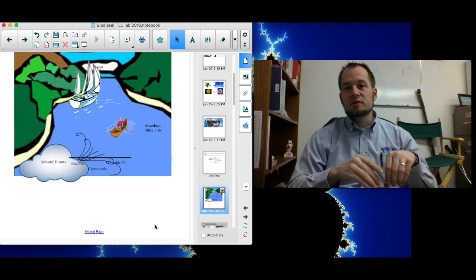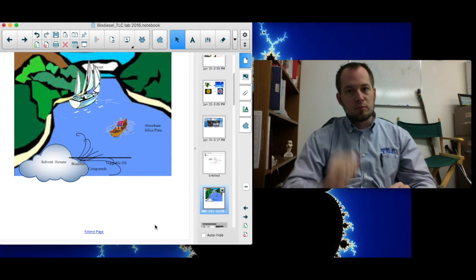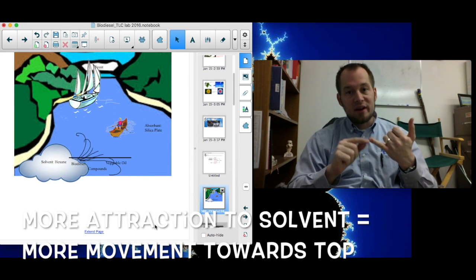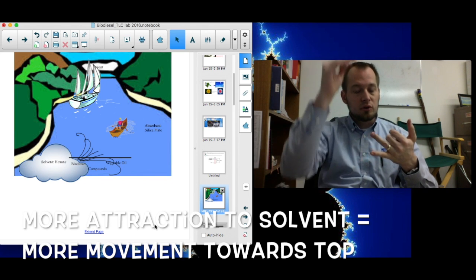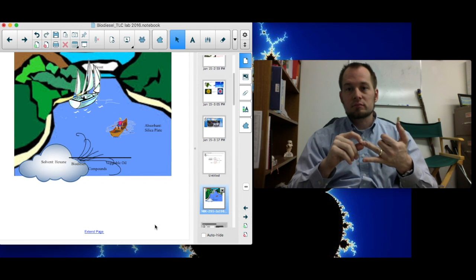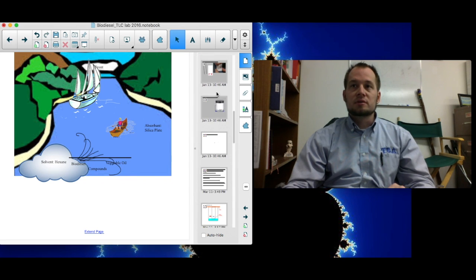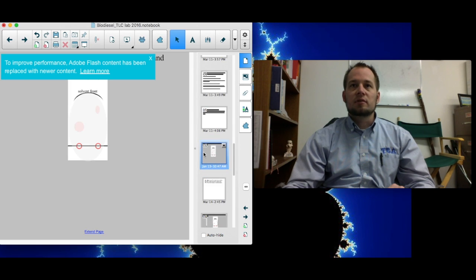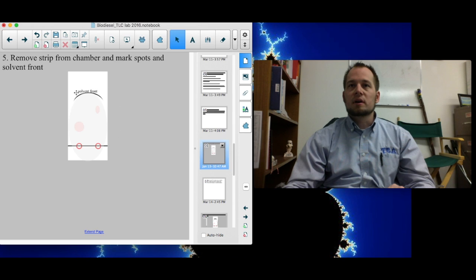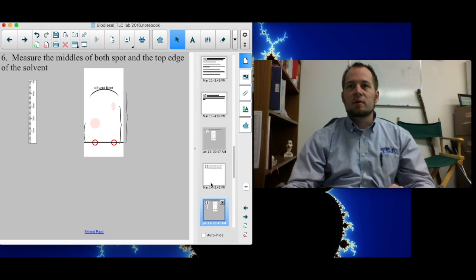So whatever substance is more attracted to the solvent, that substance will move further. That's an important point. The substance that's more attracted to the solvent will move further along, closer towards the top of the plate. Okay. So basically, when we do this with our substance, you're going to get a number. Let's see if this has any numbers on it. Something kind of like this, where you have a solvent front. You'll have one substance that traveled, another substance that did not, and we develop them in iodine.